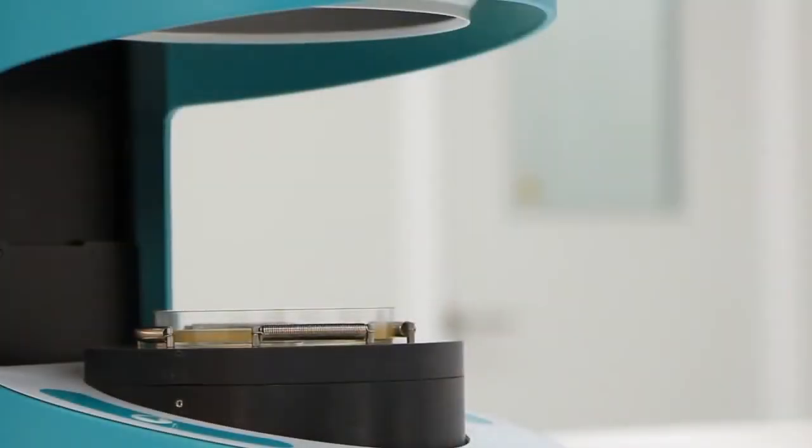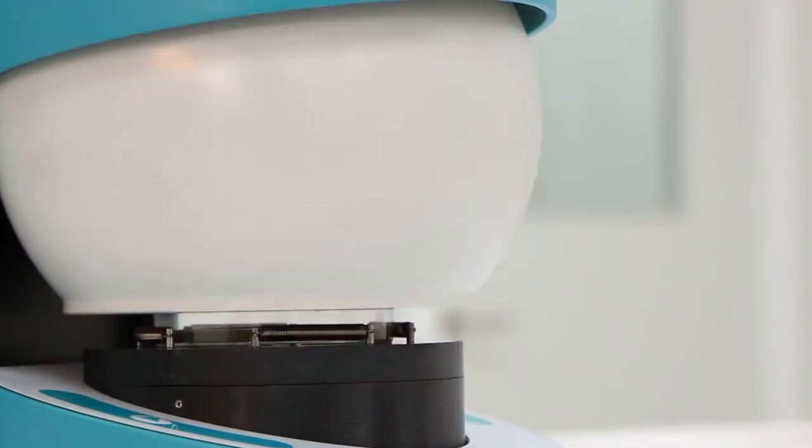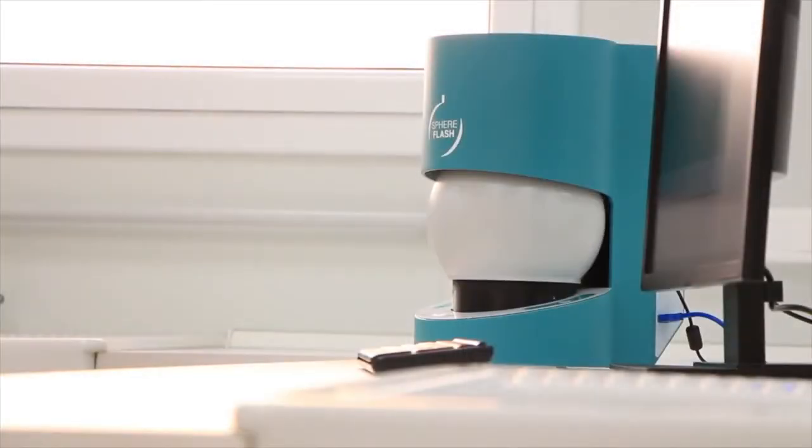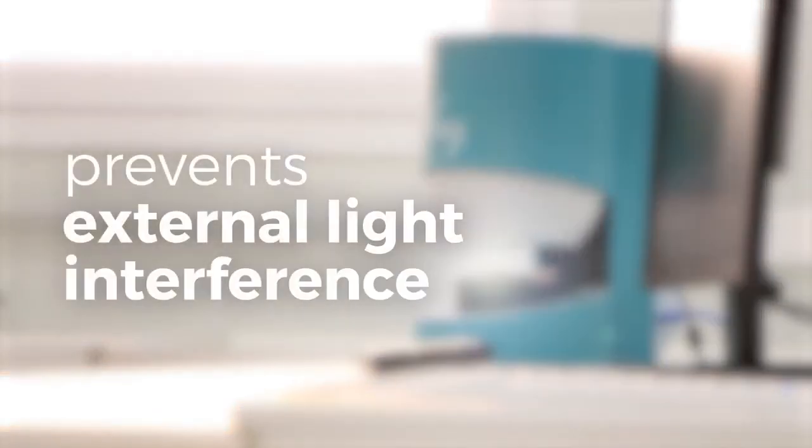Furthermore, the state-of-the-art illumination chamber uniformly lights colonies, eliminates reflection, and prevents external light interference for superior image quality and reliable colony counts.